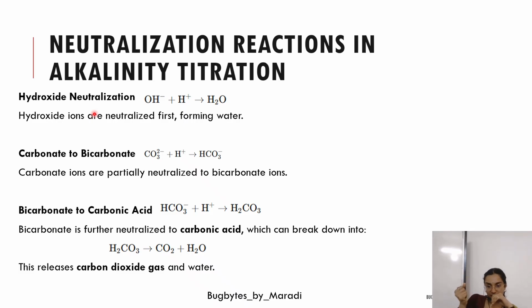You will be taking a water sample, adding phenolphthalein indicator, and titrating against an acid solution, that is maybe 0.1 normal HCl or 0.1 normal sulfuric acid or whatsoever.